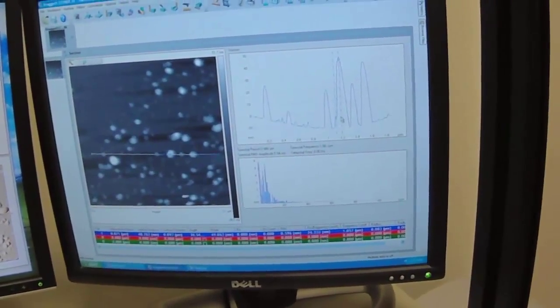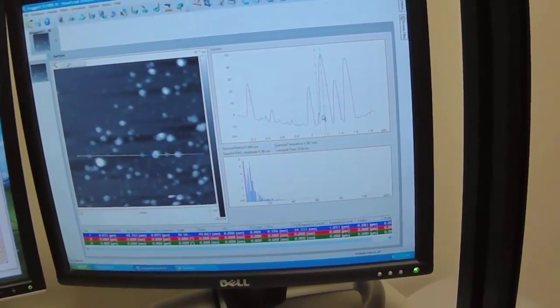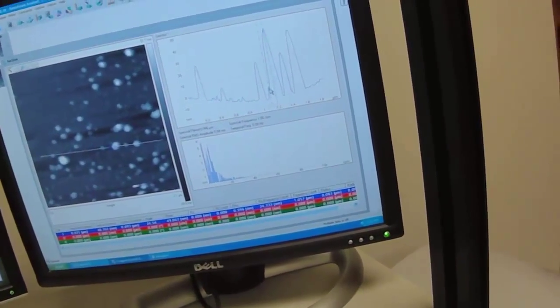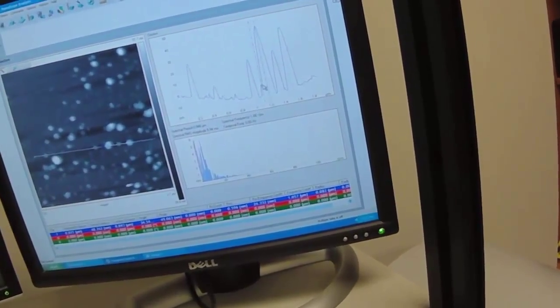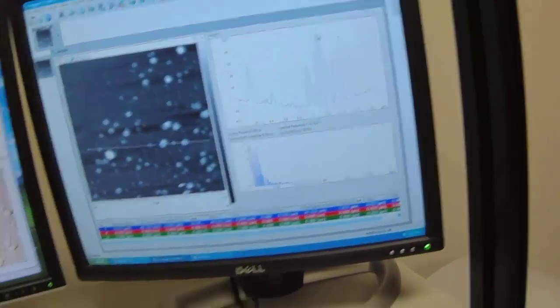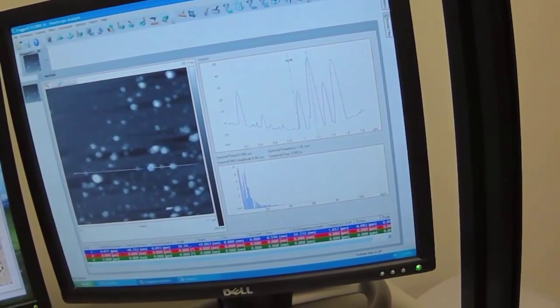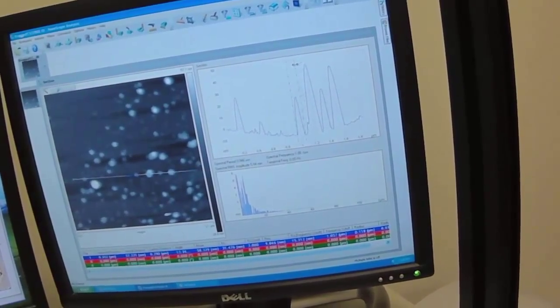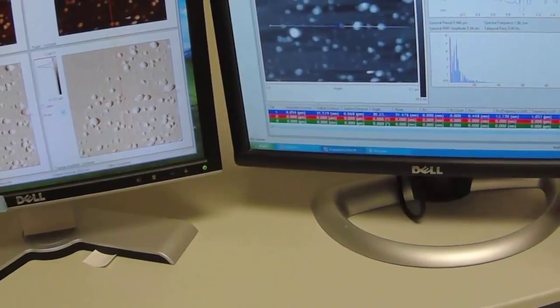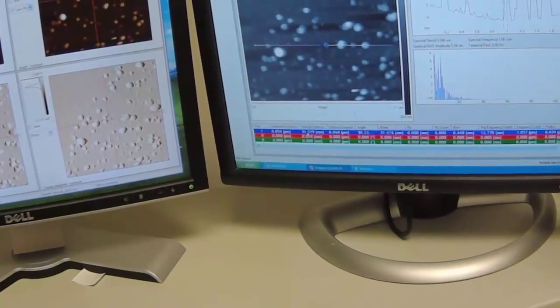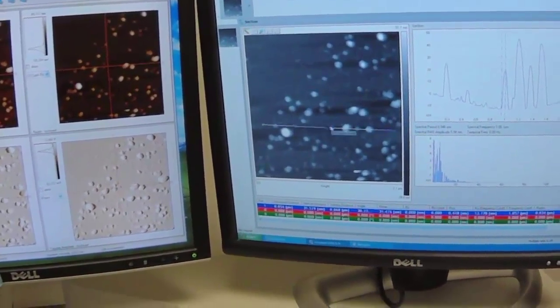There you go. There's your hint. Here's our third particle. There's a bump here, which makes me think maybe there's actually two particles. So I'm going to start from measuring here. That height, 48 nanometers tall. And so on. 31 nanometers.